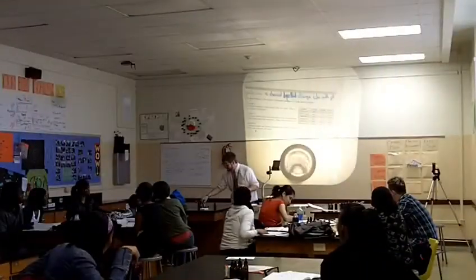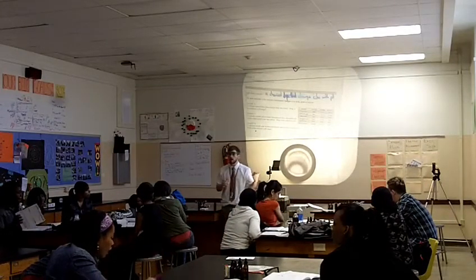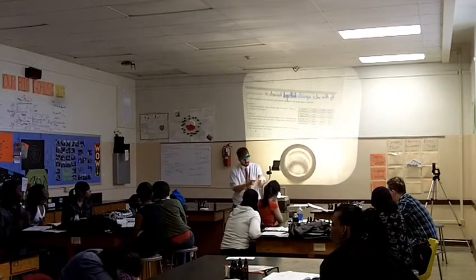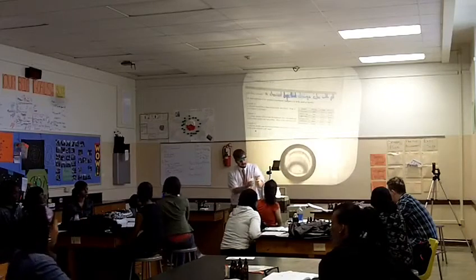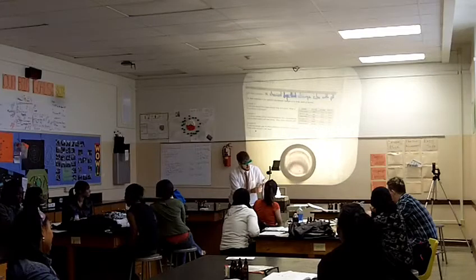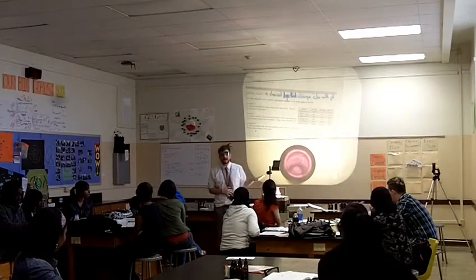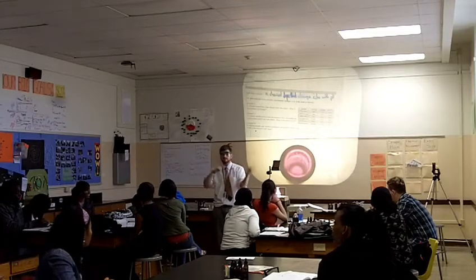Please watch this, guys. If I add base to phenolphthalein, what color is phenolphthalein supposed to turn? Like a pink or a purple or a magenta. Sure, those are all excellent color words. And so here we go with some base. Watch very carefully. Be sharp. Here we go. As I swirl, the color change here, guys, is awesome because indicators can go back and forth and back and forth.